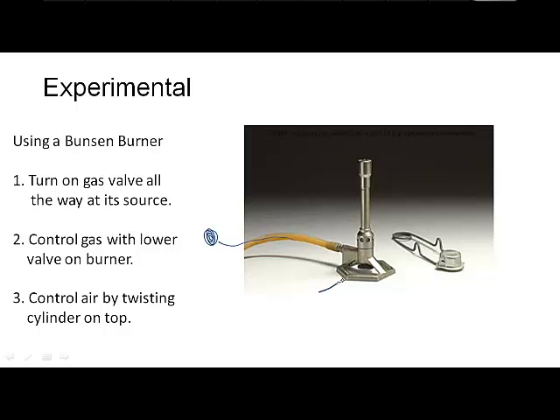You control the gas by this needle valve on the bottom. You spin it in that direction to let more gas in, spin it in that direction to let less gas in. When you let more gas in, the flame will get bigger. When you let less gas in, the flame will get smaller.